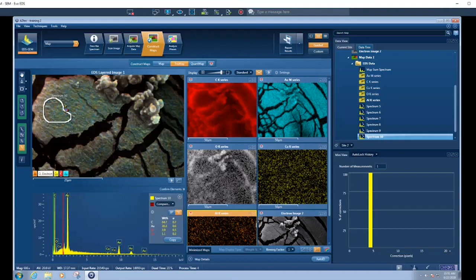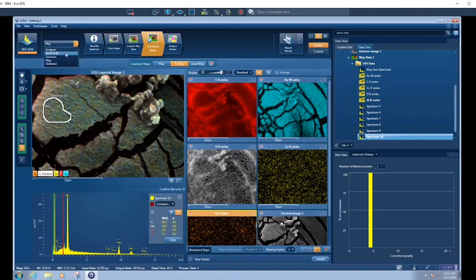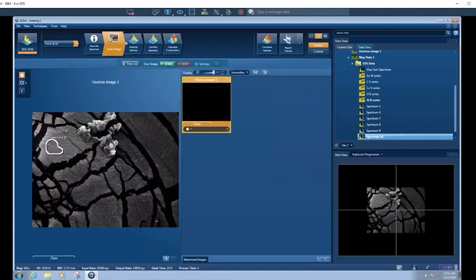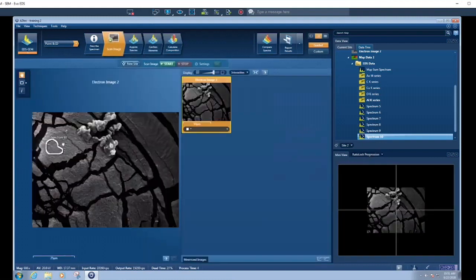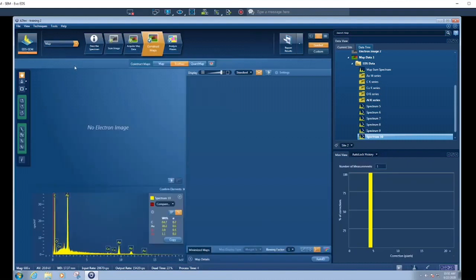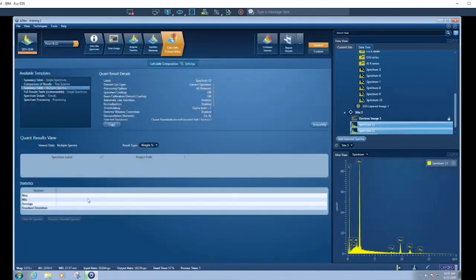So sometimes it's easier to do a map if you're not sure what you're looking for. Sometimes it's easier to do a map, get the data for a large area, and then you start to see the differences in composition. You can then either go and do a point and ID. I could now go back, do a point and ID and collect individual spectrums from those regions and get a really nice spectrum from that area. Or you do what I just did and group together the spectrum that was already collected from the map, provided it's giving you enough signal.